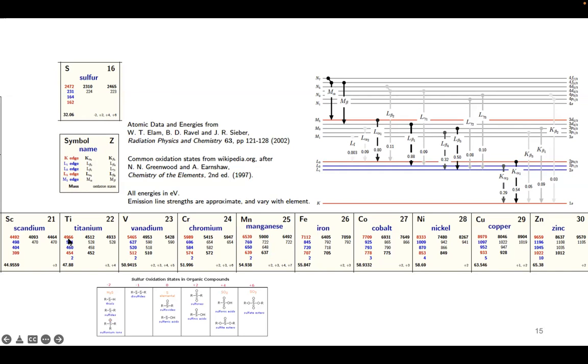You see that you have to get to a high enough energy, at least 4,966 eV, right? And so to go to a beamline that has both 2,472 and also about 5,000 eV is a really huge range for the monochromating crystal to achieve. So typically you have to go to 2 beamlines for that region. But the sulfur species is beautiful.